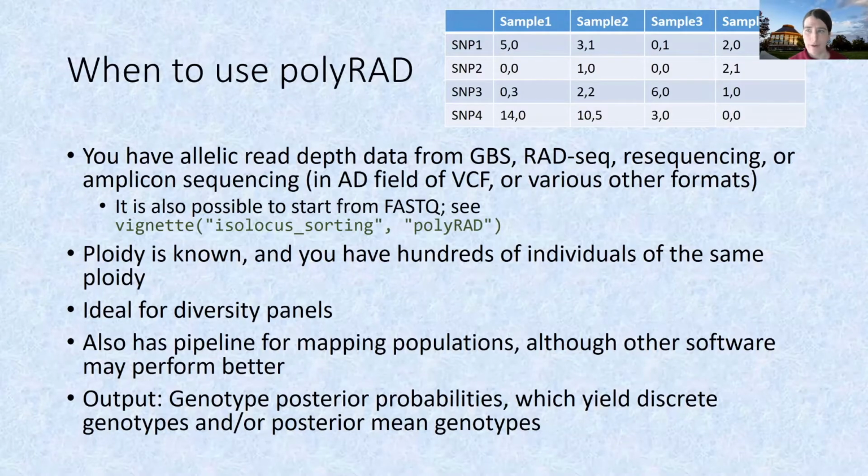It's a pair of Python scripts that can do the variant calling for you as well. Those are optimized for an allopolyploid genome or otherwise a highly duplicated genome, although you can use them for a non-duplicated genome if you want to be really good at filtering out paralogous sequences. I won't discuss that today, but I just want to mention that it's there.